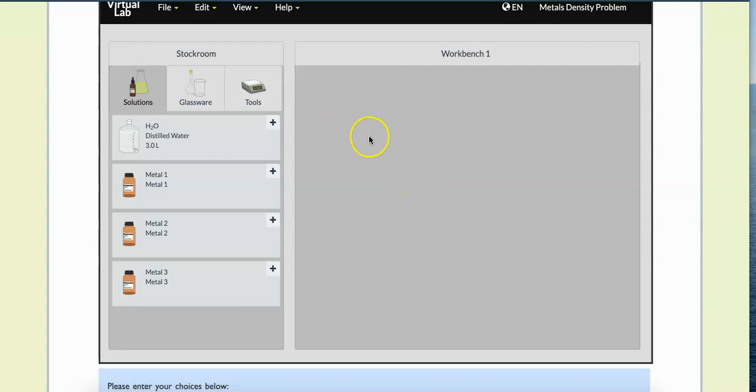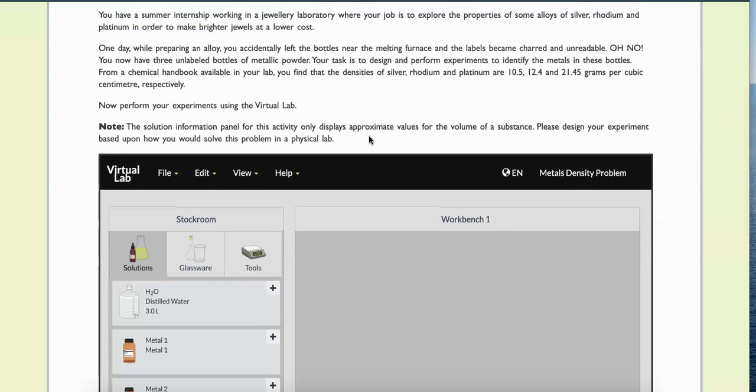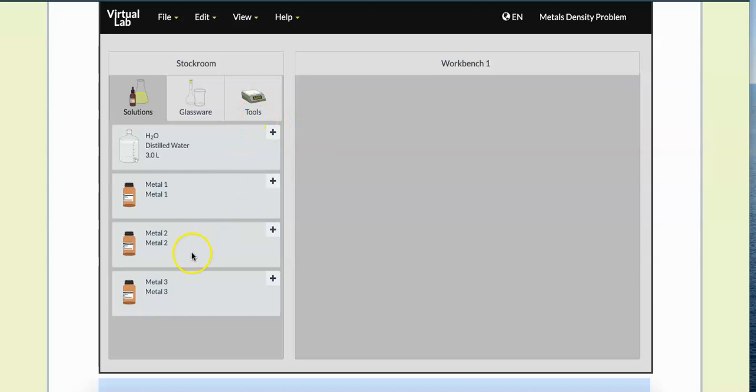Alright, this is the experiment 2 end of lab kind of test, I guess, to see if you can do this on your own. This is exactly the way that we would give this to you in the lab. I would just give you some tools, and then without necessarily giving you all the instructions step by step, you have to use what you learned from your previous steps.